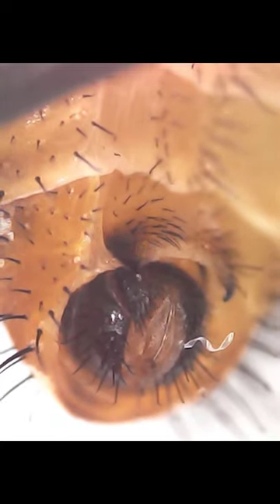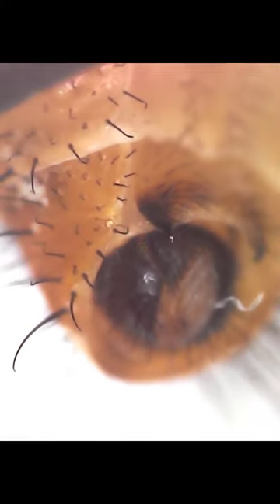The housefly has lots of hairs in its body. We cannot see those hairs using the naked eye. This is the back side of the housefly. I think this is the excretion part of it.